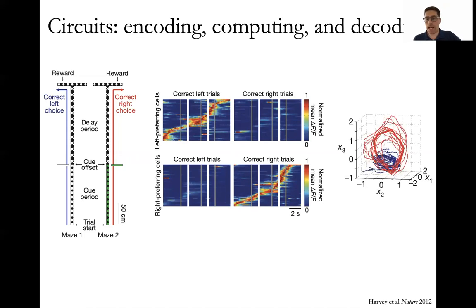And you can imagine doing more complex analyses on these, looking at the population level activity of these neurons. I'm not going to go into great detail here, but on different trials, you get different population level activity. So you can take this many dimensional activity of many, many neurons, and reduce it down to a picture that you can see in 3 dimensions of how the neural trajectory of activity unfolds for one trial versus the other.